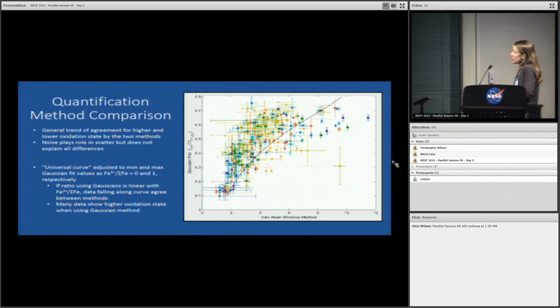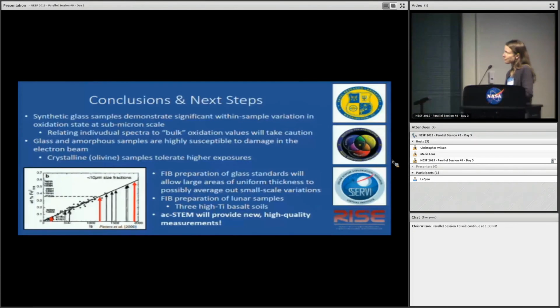There is a relationship that the oxidized ones are oxidized in both samples, but there's quite a bit of scatter, and so we need to deal with working through both reducing a lot of this error and then figuring out how to filter through and get rid of this scatter and relate these reliably to each other and quantitatively to the samples.